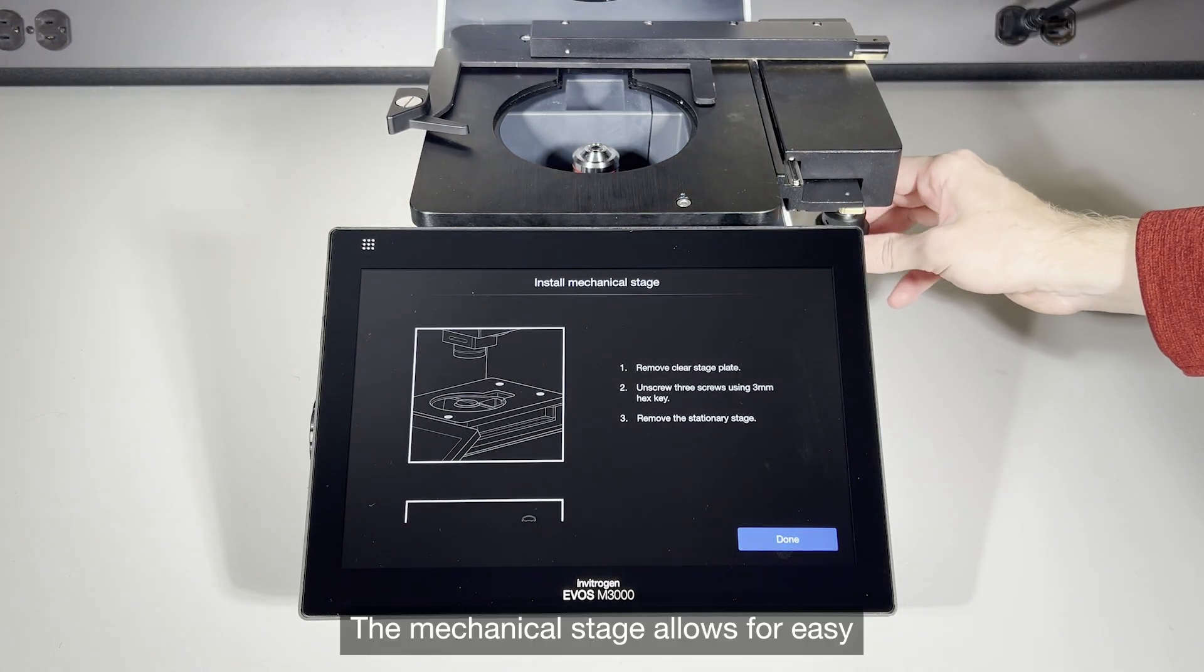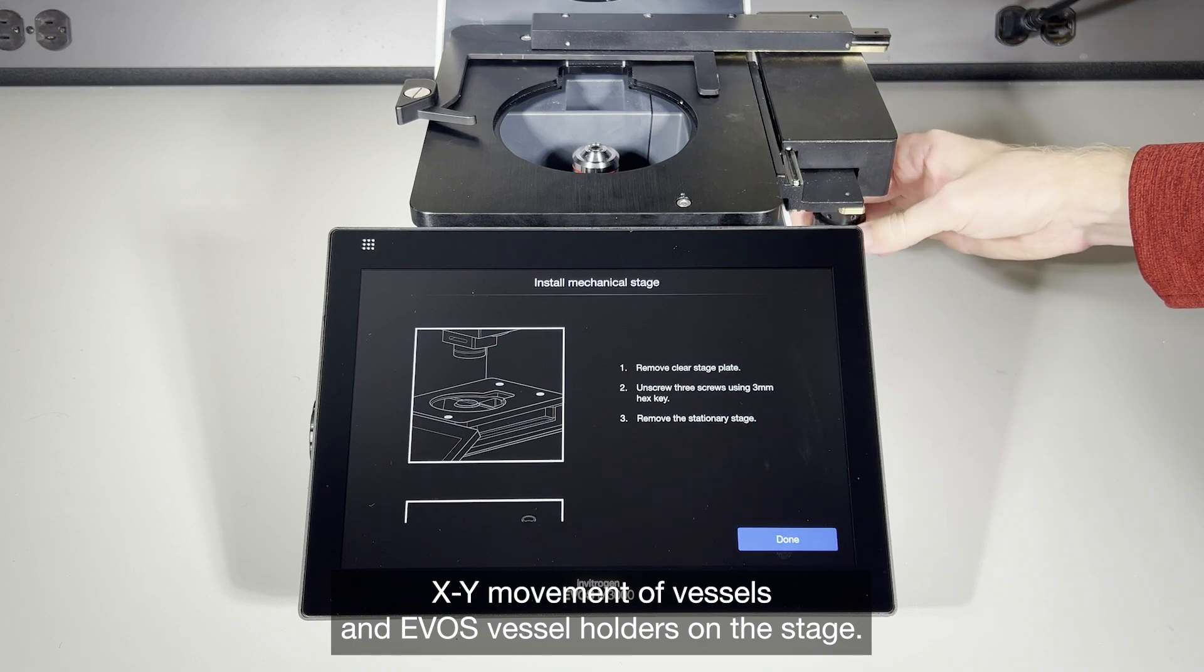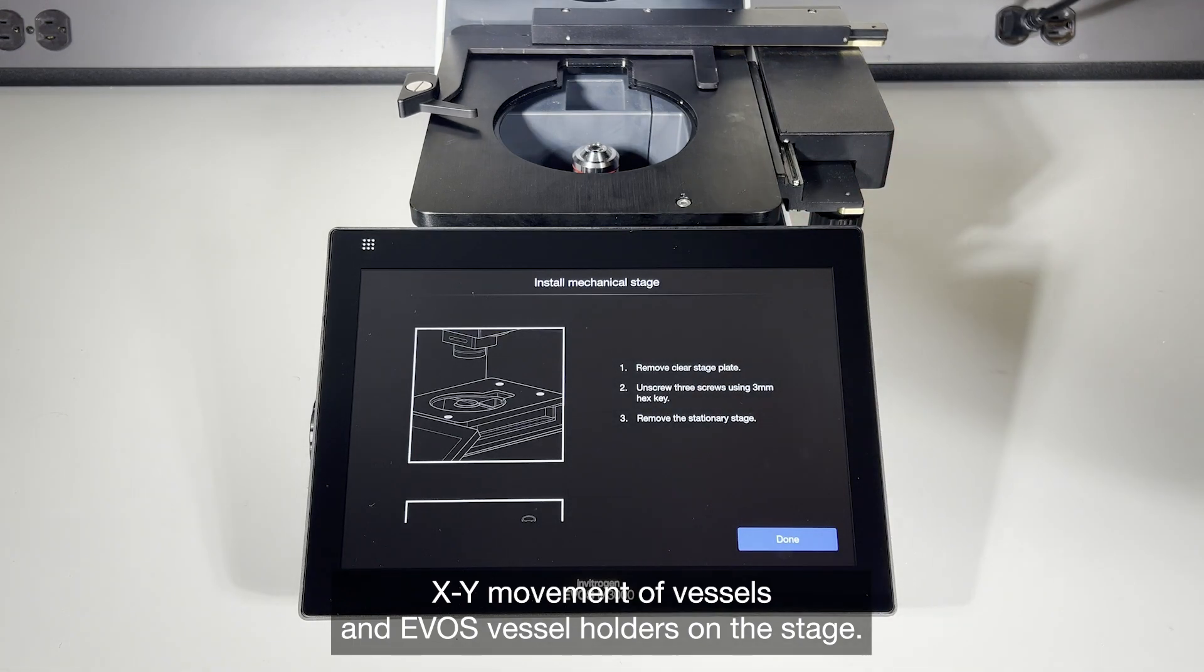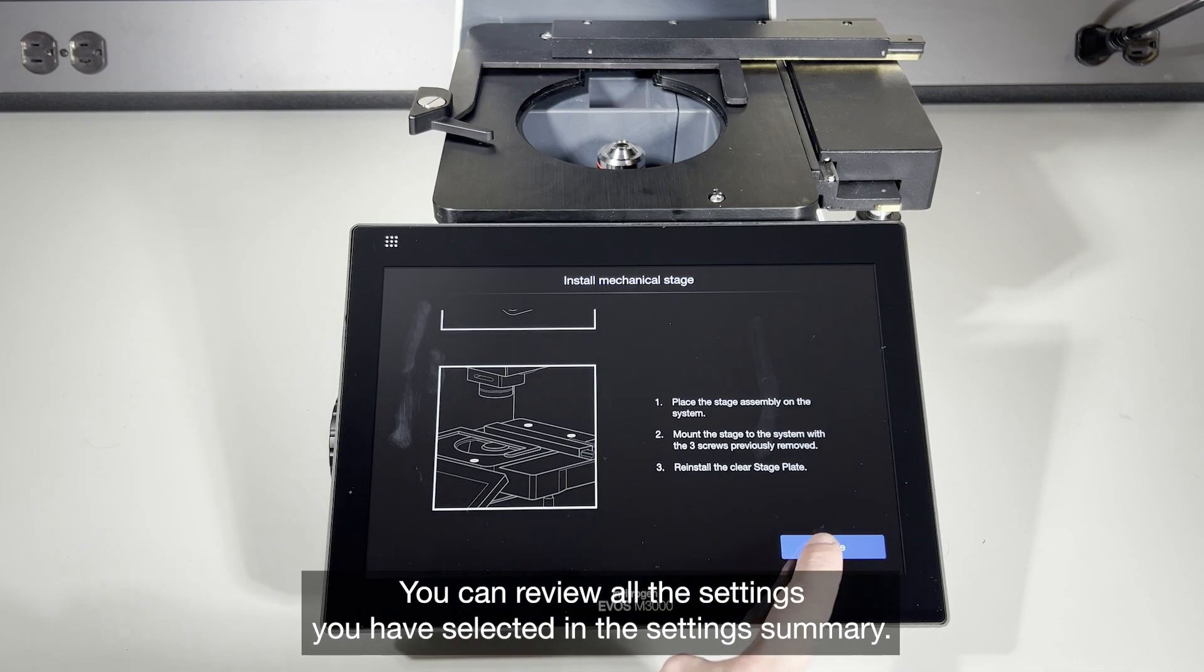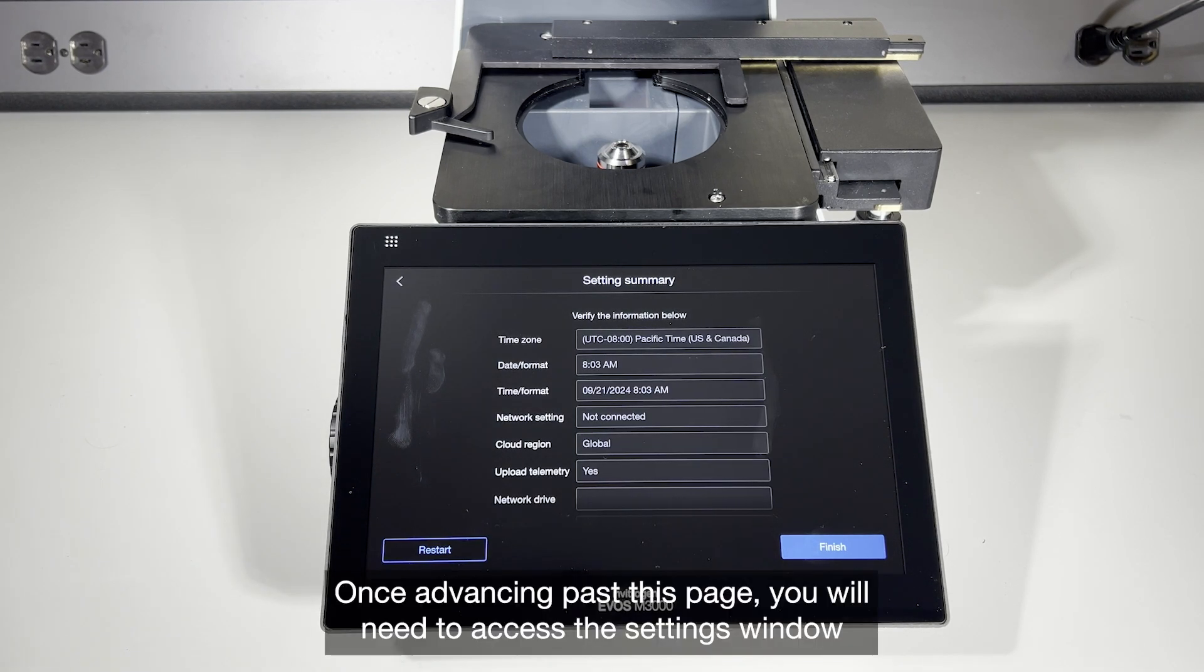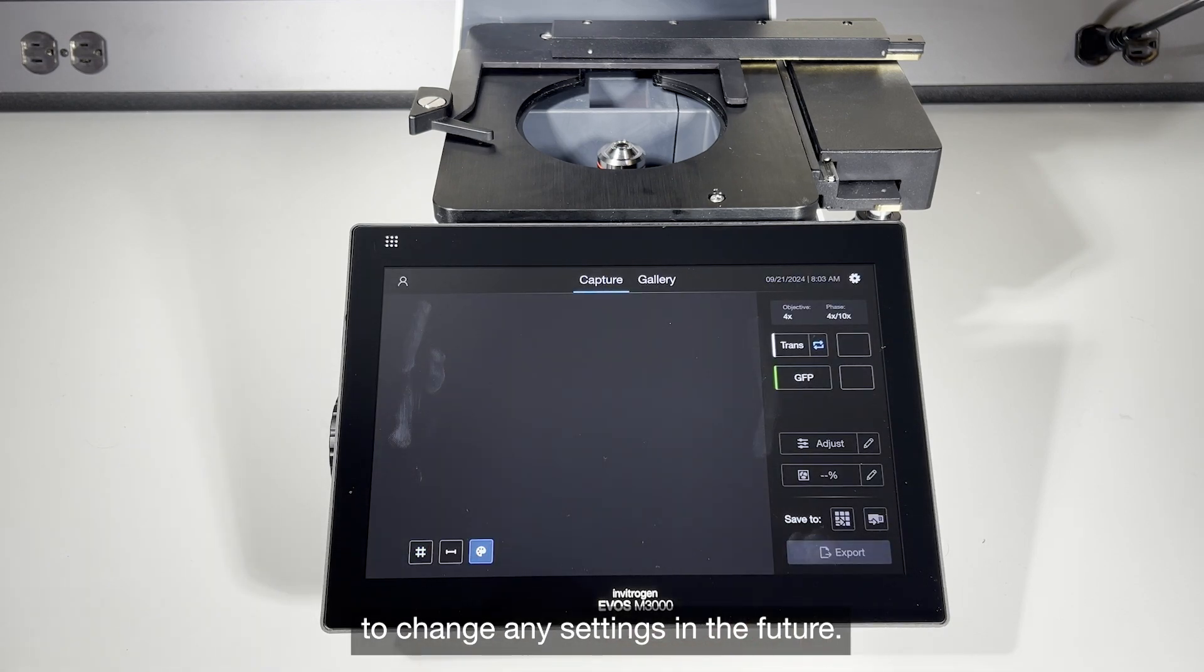The mechanical stage allows for easy XY movement of vessels and EVOS vessel holders on the stage. You can review all the settings you have selected in the settings summary. Once advancing past this page, you will need to access the settings window to change any settings in the future.